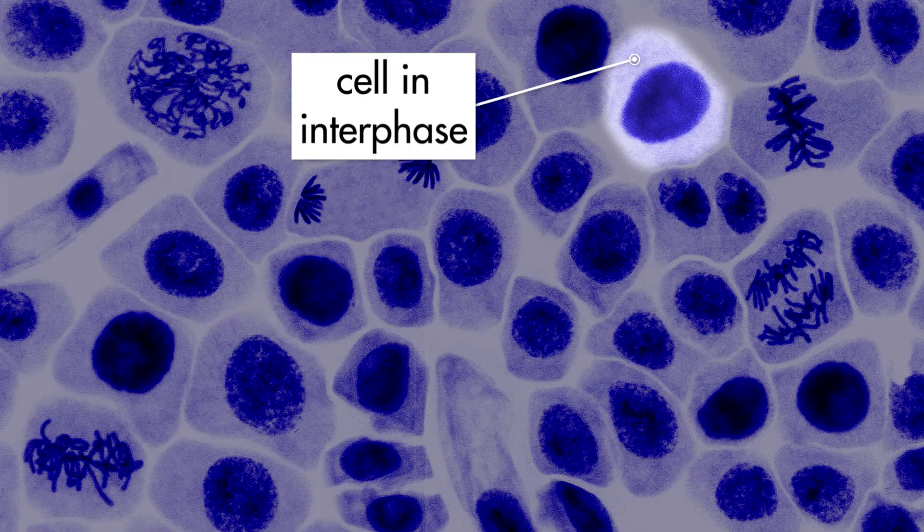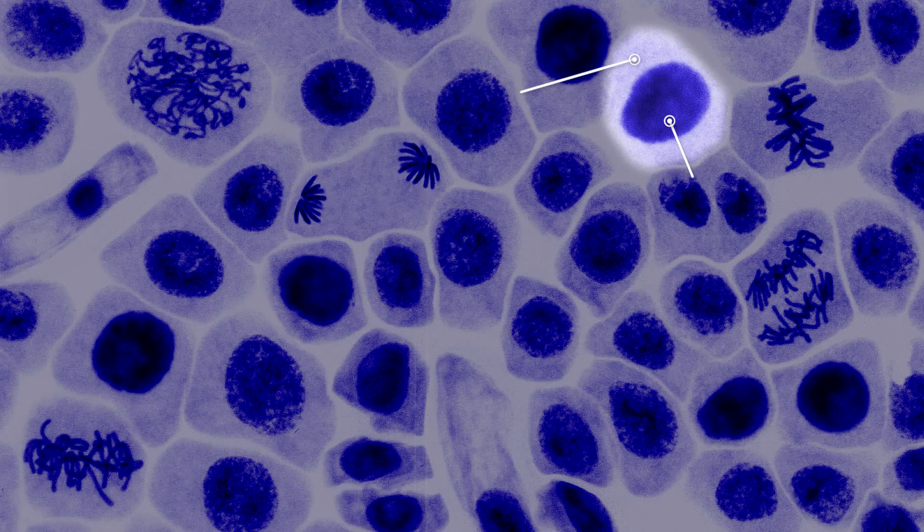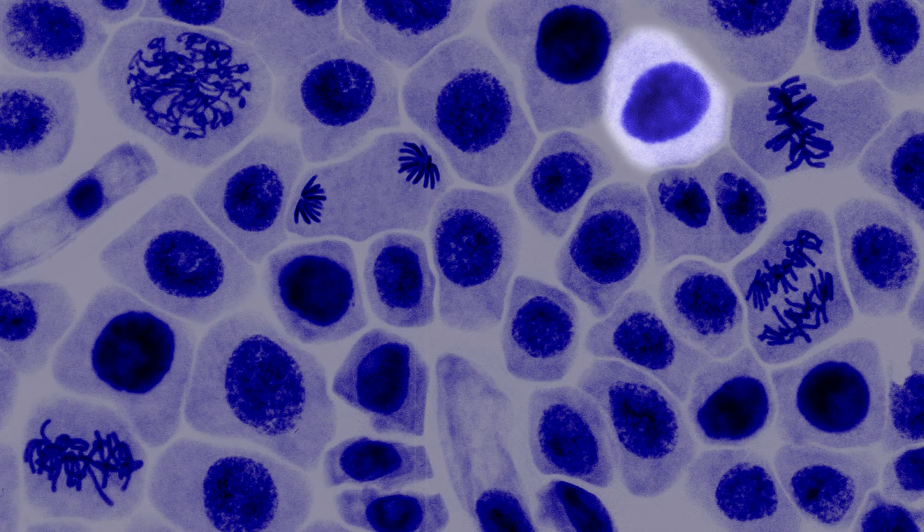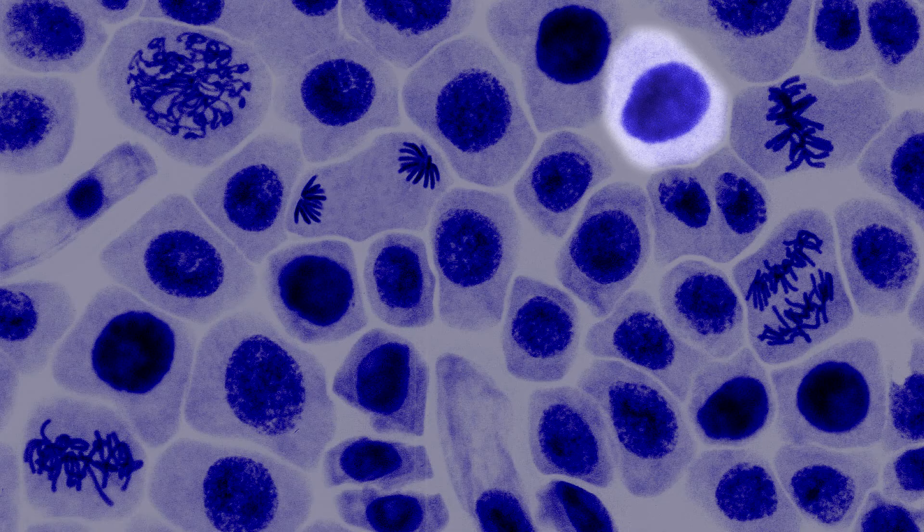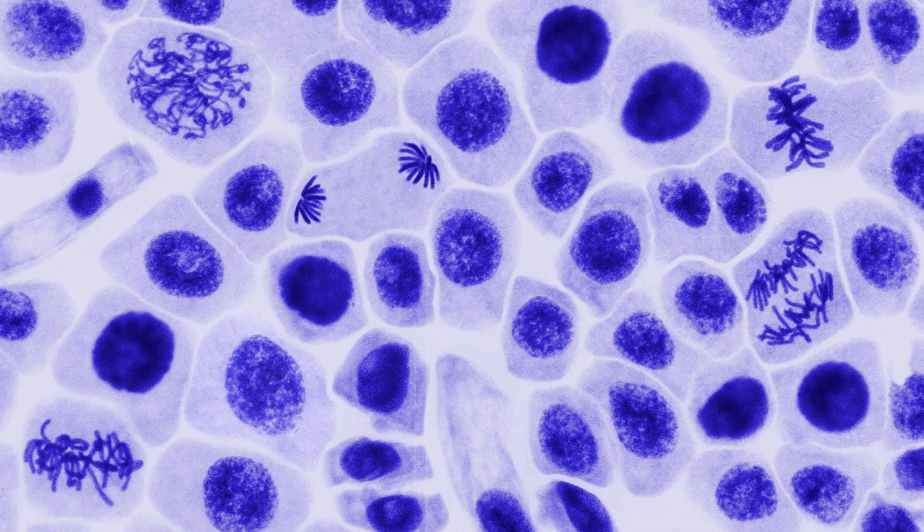During interphase, the nucleus of the cell appears to be a cloudy blue. The toluidine blue has stained the DNA, but the individual chromosomes are not yet visible because the chromosomes are spread out in long intertwined strands. Near the end of interphase, each chromosome in the cell's nucleus undergoes replication. Replication is the process by which a chromosome produces a duplicate of itself. Now that the chromosomes have replicated, the cell is ready to begin the first phase of mitosis called prophase.